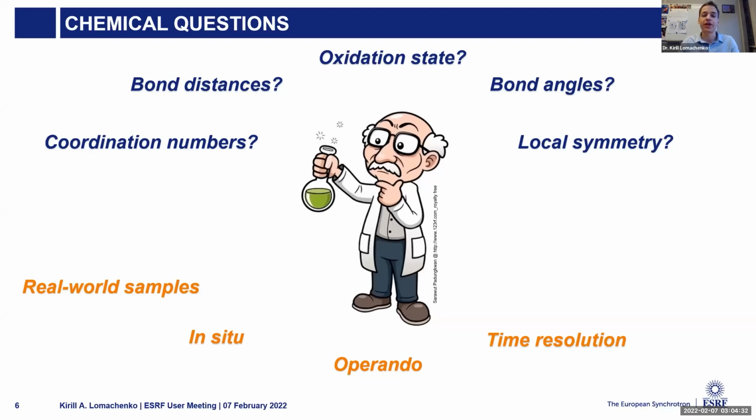And sometimes, actually quite often, you want to be element selective, because only particular chemical elements or chemical species present in your material define the properties of interest. Like, for example, it can be the active sites of your catalyst.